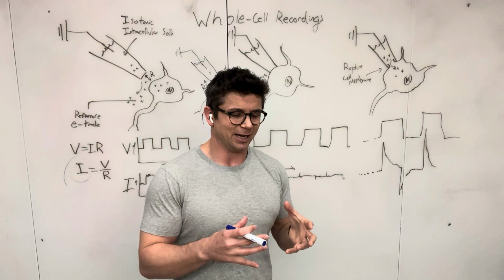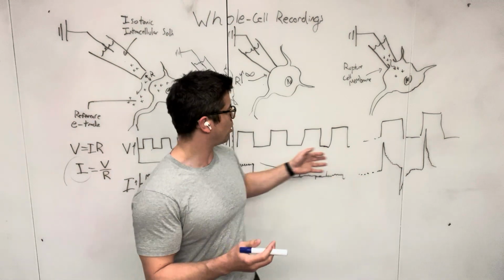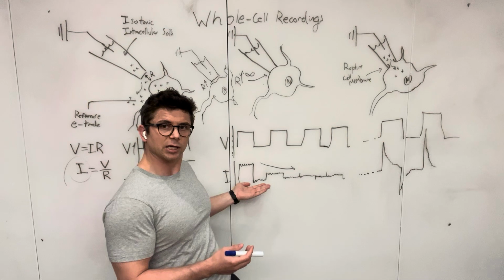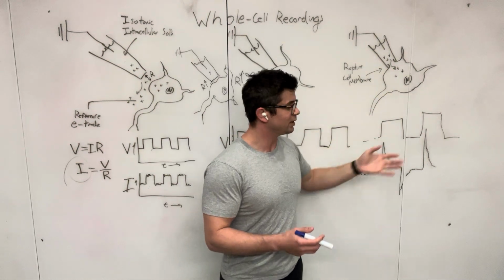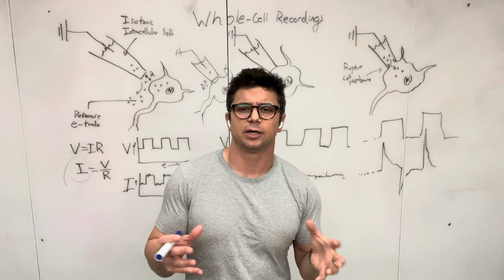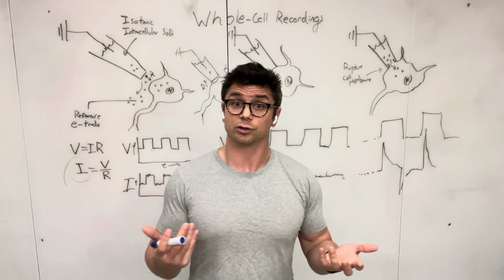And you can watch this happening on a computer or an oscilloscope as you're doing this experiment. So you can tell, oh, I formed this seal because I'm getting no response in my current, and then, oh, boom, I've ruptured and I'm now in the whole cell configuration. I have a continuous solution between my recording electrode and the inside of this neuron. And it's at that point in time that you do your experiment, right?